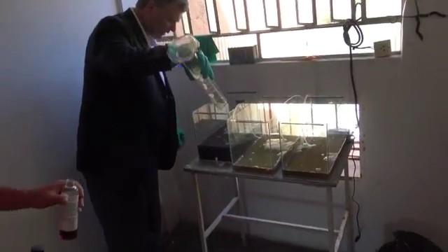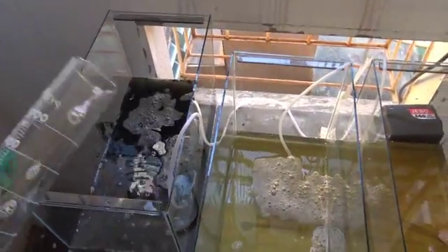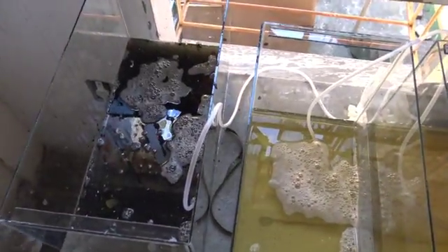There is some oil in here, the way you can see OSE II beating up initially. So there is some oil content.